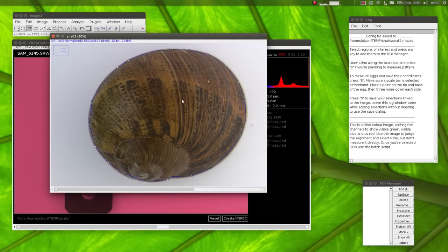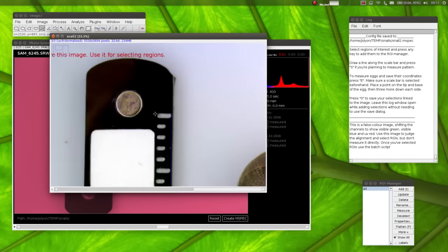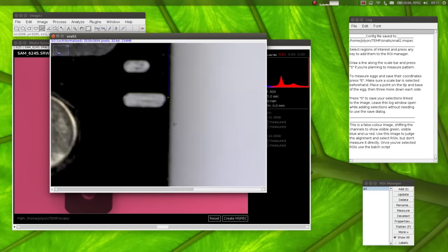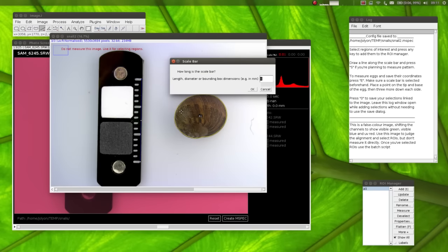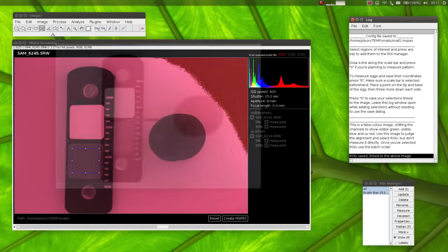Then again, I'll call this A. It comes up as A1. And now I need to select the scale bar. Press S for the scale bar, and that's 30 millimeters long. And then press 0. And there we go, ROI saved with the image. So we can close that.